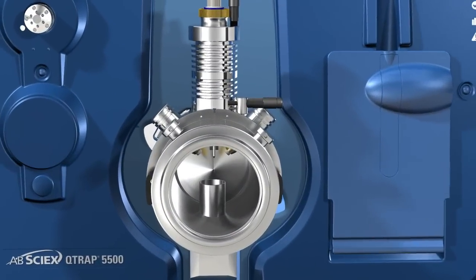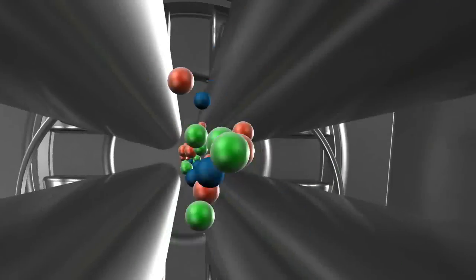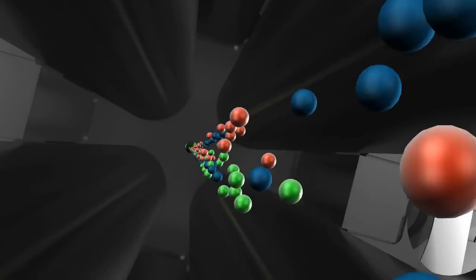Downstream from the industry-leading Turbo V-Source, the new Q-Jet Ion Guide further improves on patented collisional focusing to optimize transition and give ultimate sensitivity.